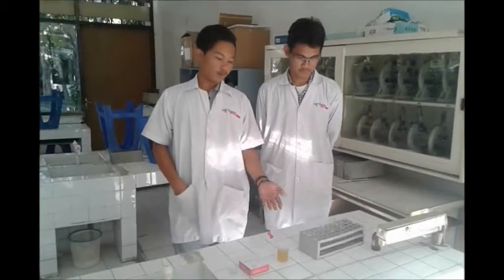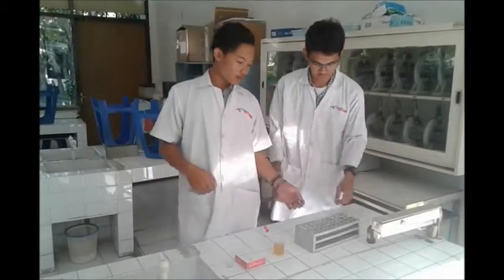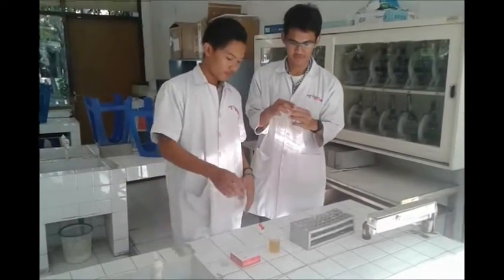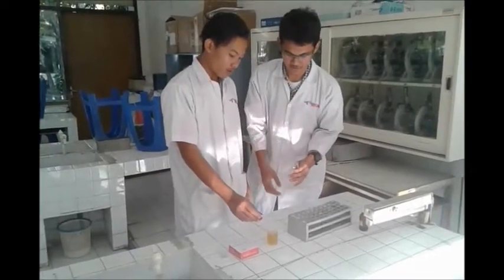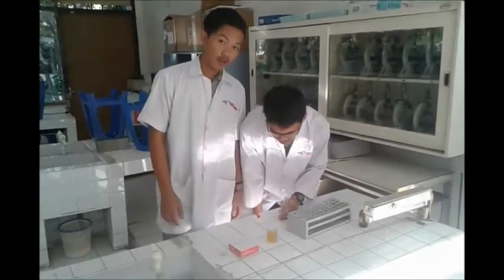First, prepare all materials. Next, take two centrifuge tubes and fill with the sample.